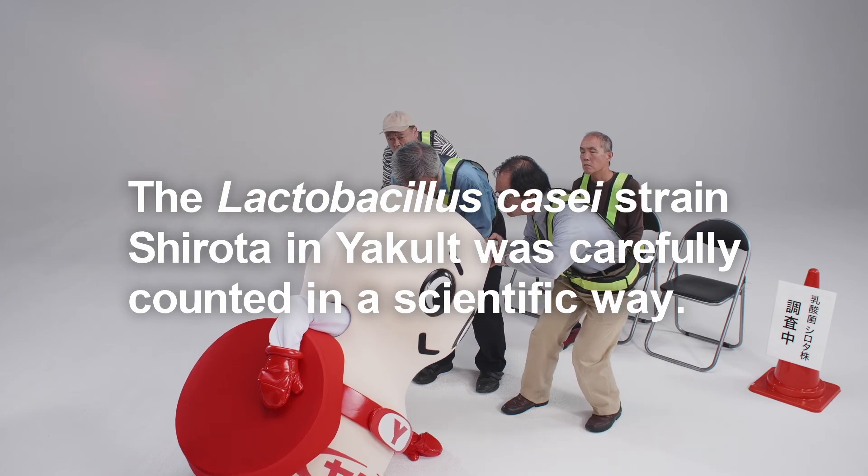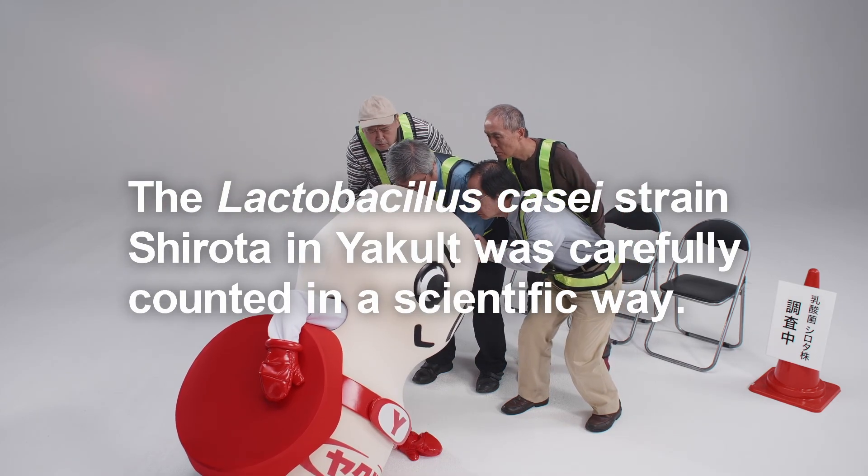The Lactobacillus casei strain Shirota in Yakult was carefully counted in a scientific way.